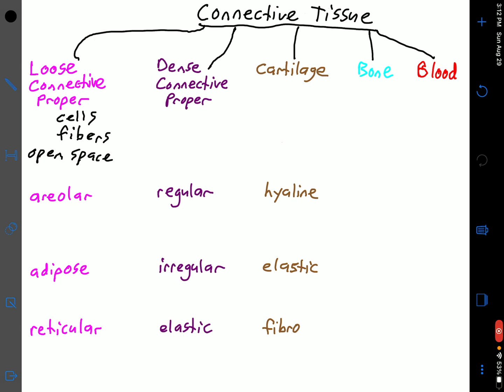If you see cells and fibers but not much open space, that's dense connective tissue proper. Dense implies denseness, and therefore not much open space. So when comparing loose connective tissue proper versus dense connective tissue proper, you're really looking for: is there open space, or is there not open space?